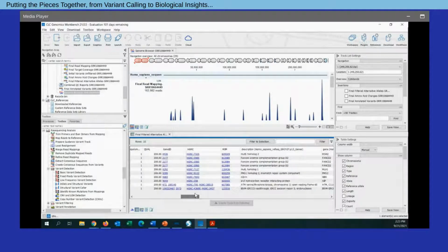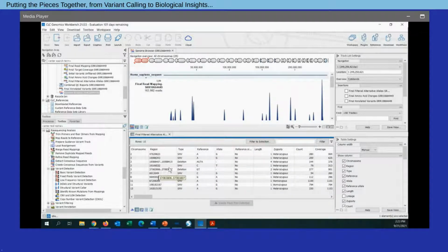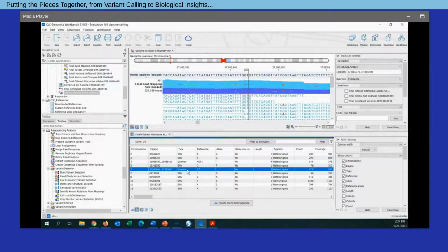And towards the end of this, information relating to, again, annotation of the specific variants identified. For any of these variants, they're dynamically linked to the genome browser-based view above, such that I could come in the table and focus on this particular deletion. It's in the MLH1 gene, so a gene of note for Lynch syndrome.